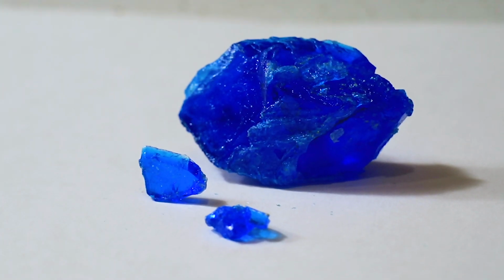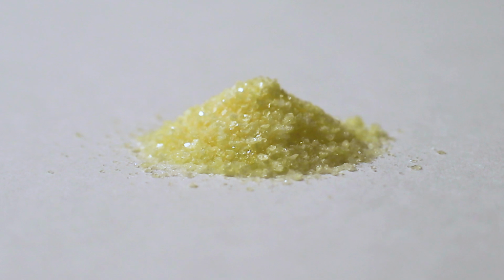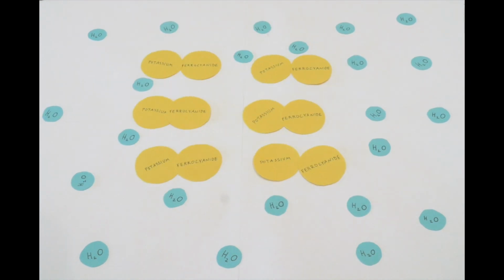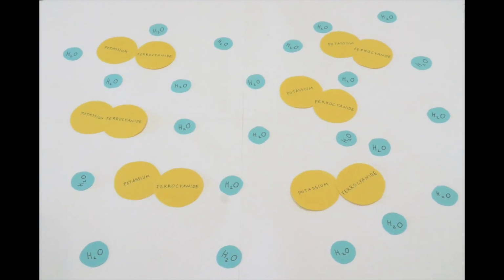The two chemicals we will be using are cupric sulfate and potassium ferrocyanide. Cupric sulfate is made up of copper and sulfate, and potassium ferrocyanide is made up of potassium and ferrocyanide. Both of these chemicals dissolve in water, meaning that they break apart when mixed with water. They stay evenly spread out through the mixture, making it a homogeneous solution.